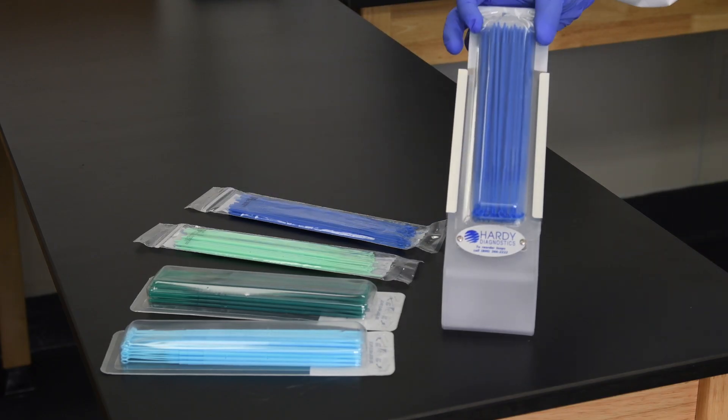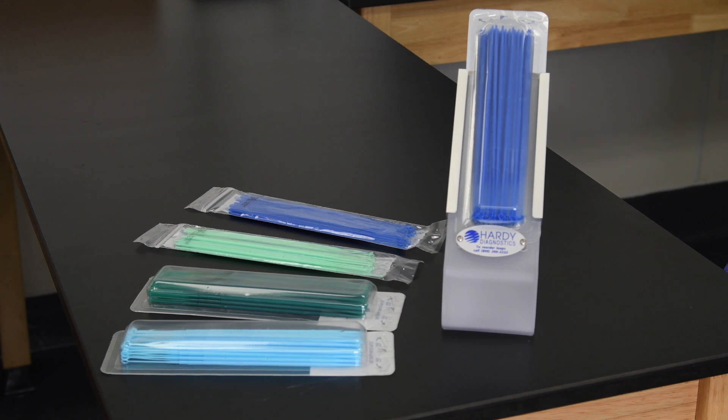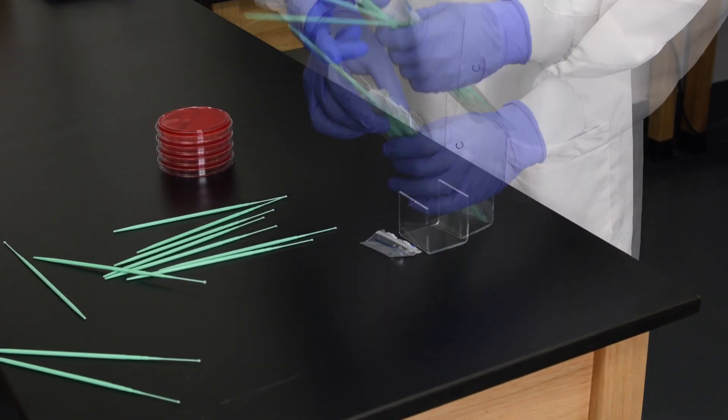The Loop Caddy is the ultimate in loop management, allowing for a better way to handle disposable loops on the benchtop.